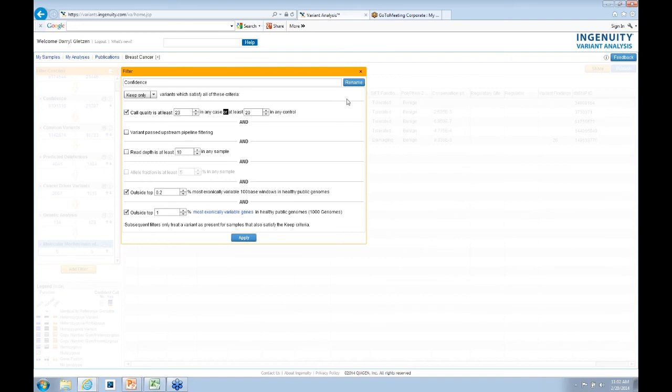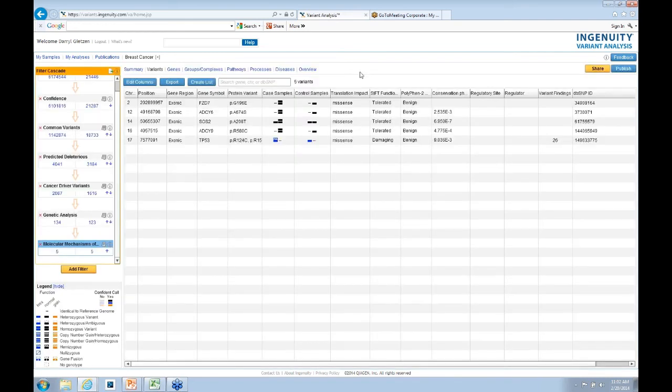Okay, since we're running a little bit over on time here, we'll handle one more question here from Paul. He asks, how do you know the variant is an artifact? You never know, and that's kind of the challenge.